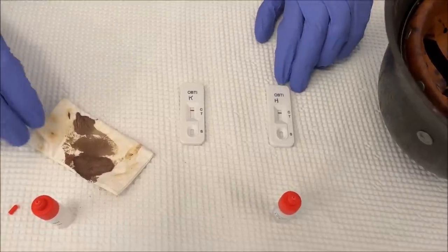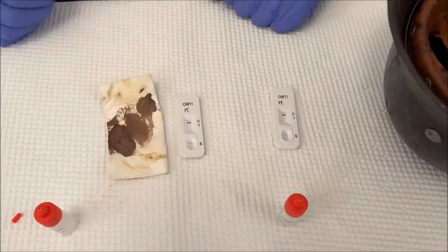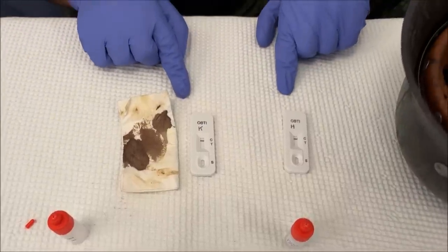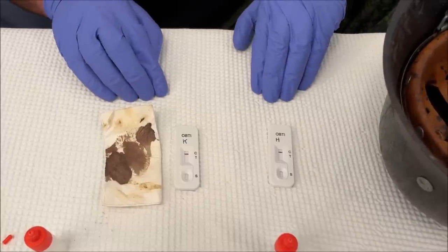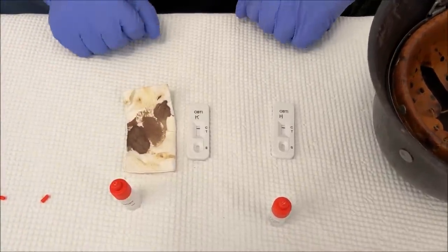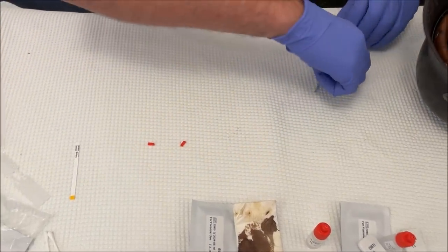Theoretically this means there's no human hemoglobin in either sample — but that doesn't mean anything for the helmet, because we know this kleenex has my blood on it and the test says negative anyway. What the police told me is that this test is very sensitive for human blood but needs quite a large quantity to become positive. Apparently it isn't good for very old, dry blood. The good news is that the police also gave me a second test, so we'll try that.